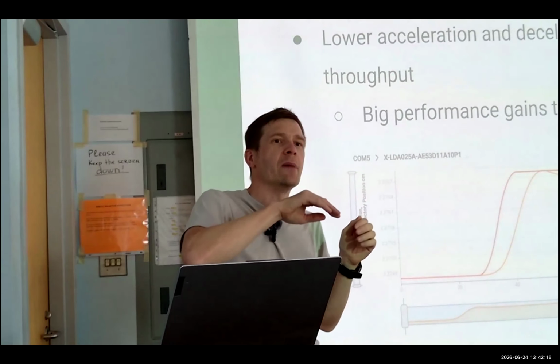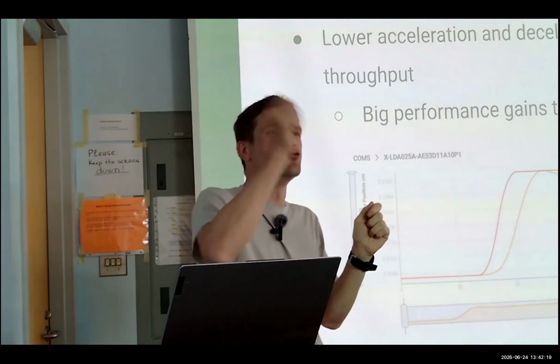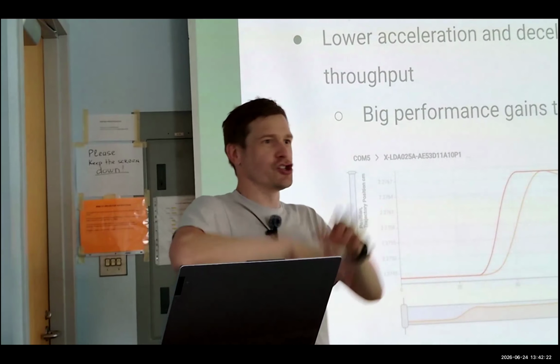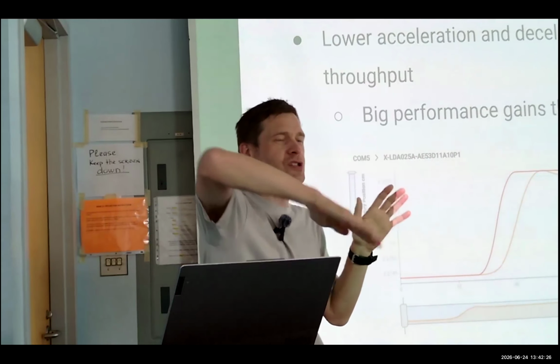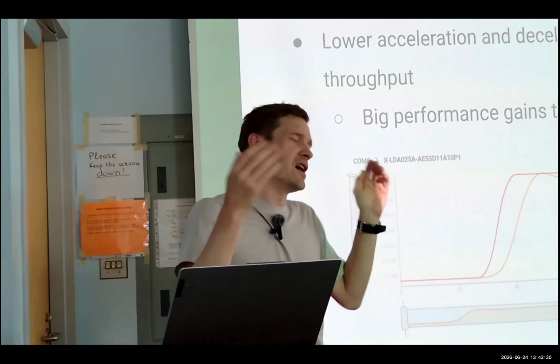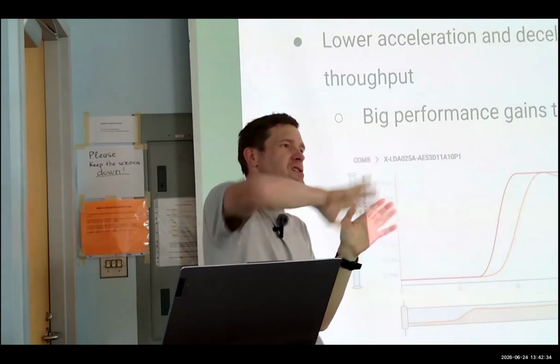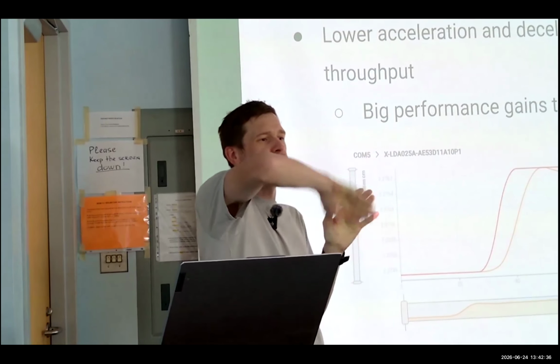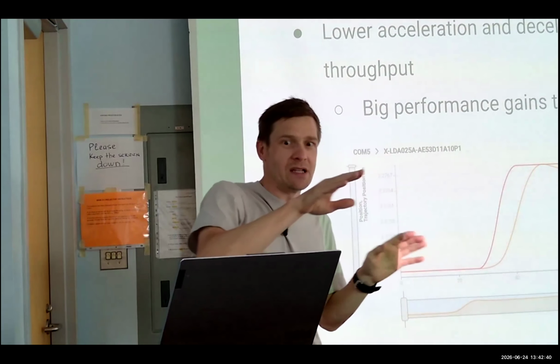It can be really tempting to just crank everything up to 100 and go as fast as you can. Then what happens is you overshoot, and then you undercorrect, and you wind up with the stage ringing, and it takes longer to settle than you want. Backing things off a bit so that they arrive exactly where they're supposed to and then stop, that's the way to do it.